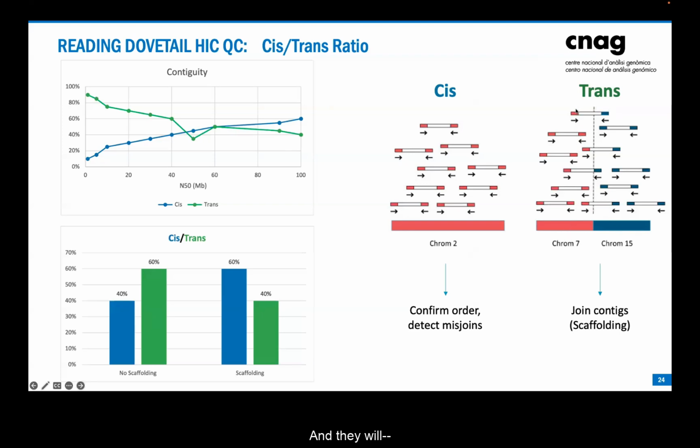With very good assemblies, when you map the Hi-C reads, you easily localize chromosomal territories, sometimes even without the scaffolding. Of course, the bioinformatic QC is totally dependent on the reference. You need a reference, otherwise you cannot map the reads. If you have no contiguity in your assembly, you will expect a huge amount of trans mappings.